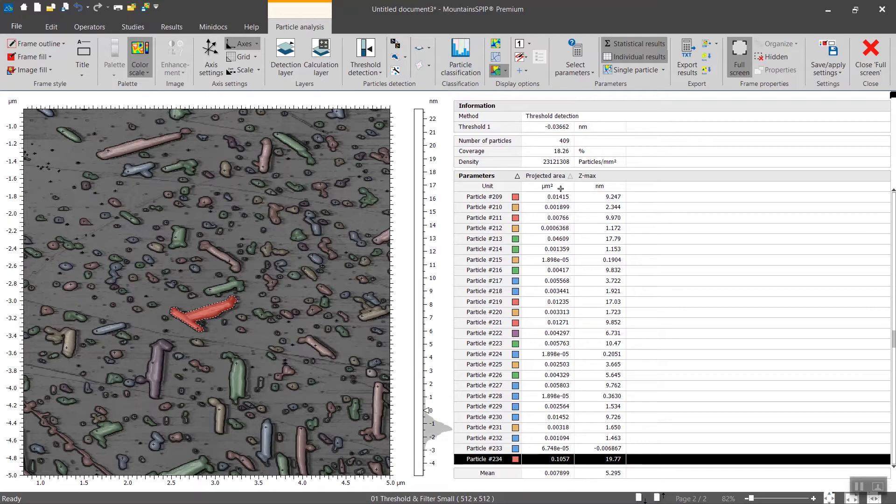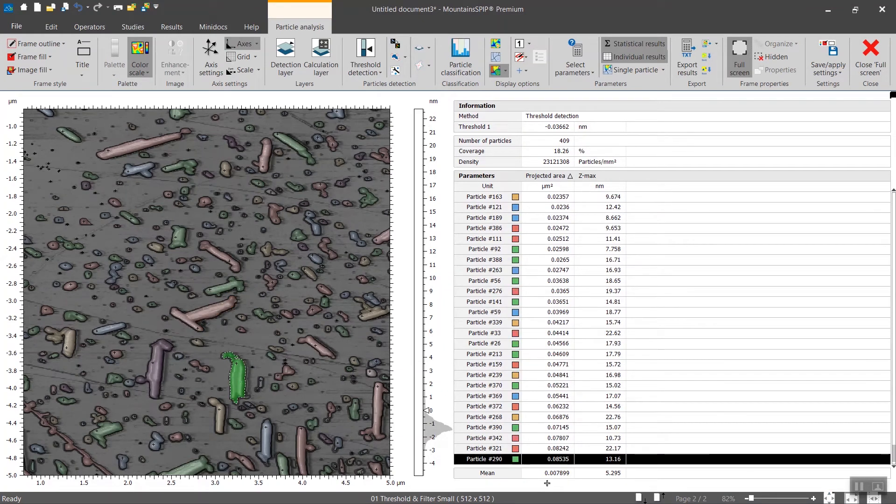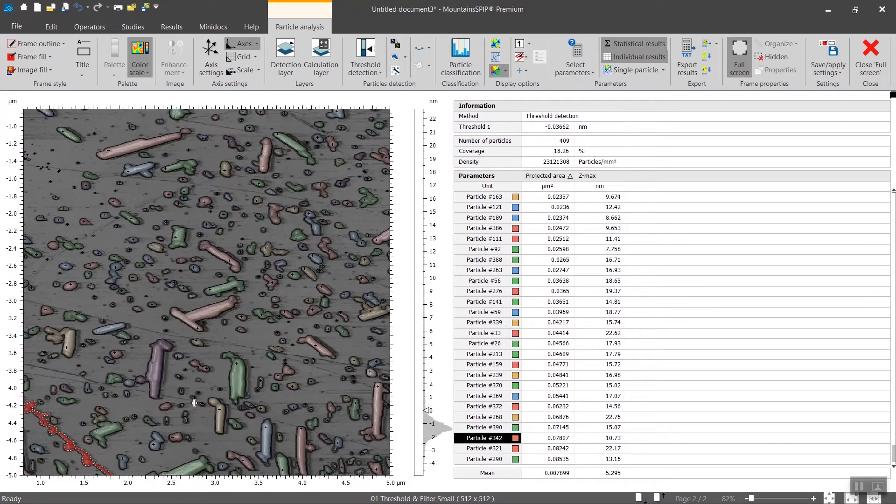You can sort the particles not by the ID number but by the projected area for instance. And again you can select one here but you can also select one particle from the table and then it will show you its place directly in this view.